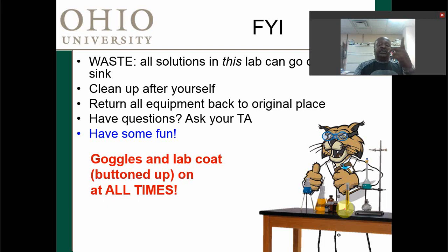After you're done, by the way, all solutions can go down the drain today, just with a bit of water. Clean up your station when you're done. And this is important: return the equipment to its original place. Check Appendix D or something like that. It will tell you what is supposed to be in the data logger box. Take a look at that and make sure that that's what you have. Nothing extra from other boxes or other places, because then the next group that comes is in trouble. They can't find whatever they need. So again, check the equipment and make sure that each data logger box has a full complement of what is supposed to be there.